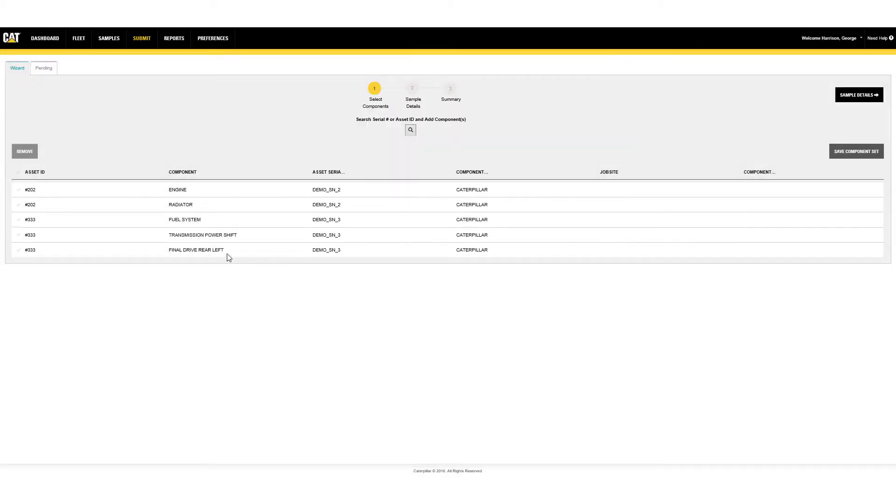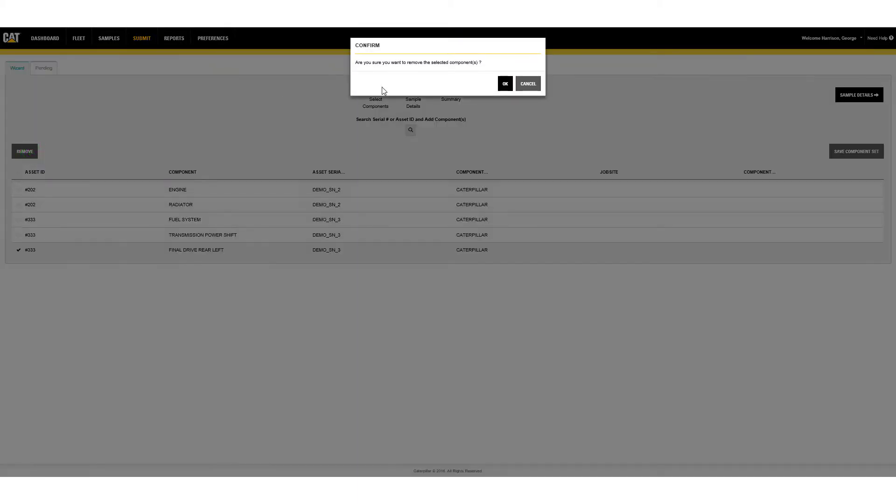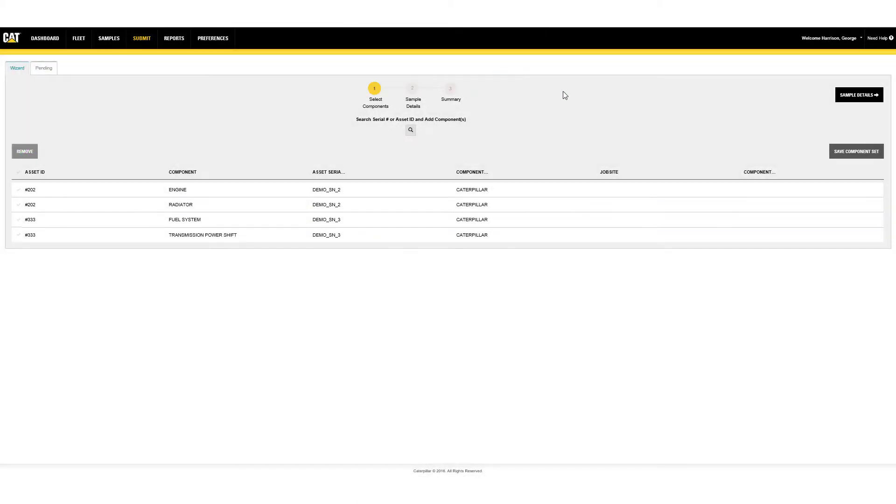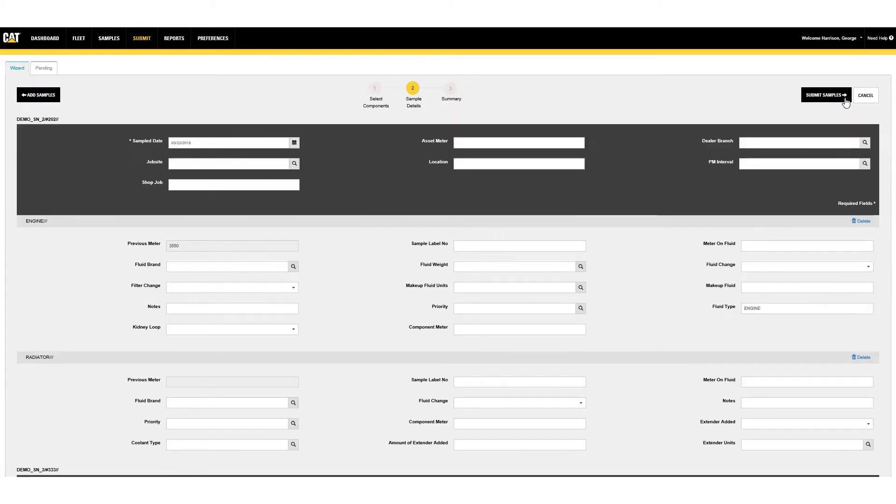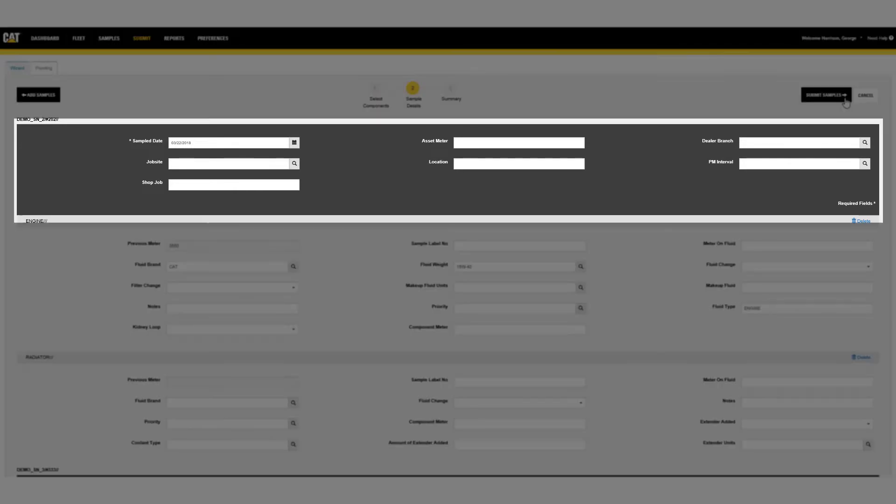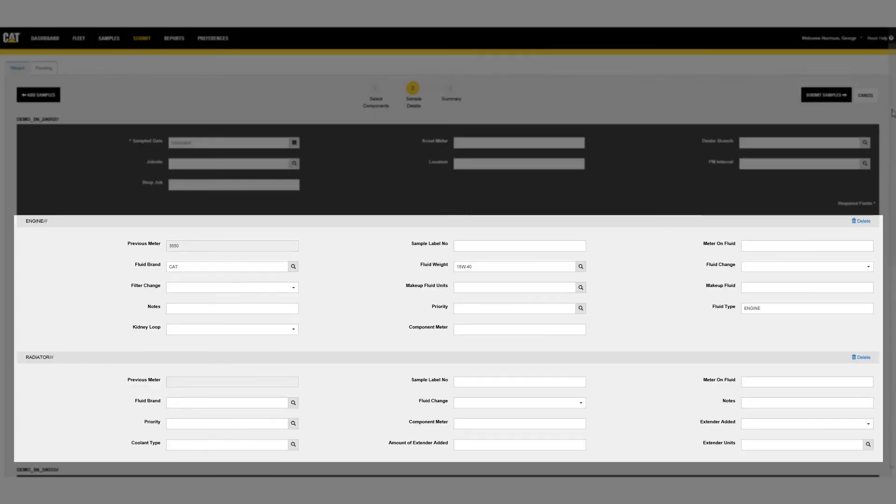Remove incorrectly added line items by simply selecting the component and clicking Remove. Once the desired list is created, click on Sample Details to move to Step 2 where asset and component information is entered. The dark gray areas are for the asset, the light gray areas are for the individual components.